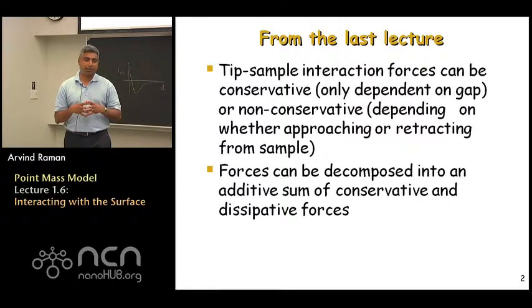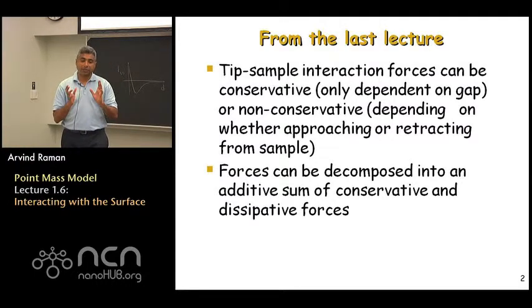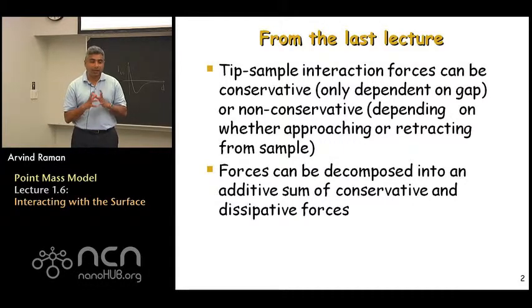All these are different anelastic or dissipative phenomena that ensure that the force encountered while going towards the sample is different from when it's coming out during an oscillation cycle. And so this additive decomposition is a nice mathematical way to keep track of both these components.